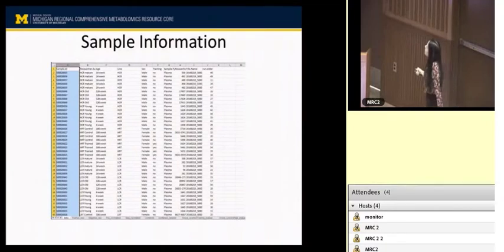And so then with the QC plots, we also give this spreadsheet which has the first tab with the data information that is submitted by the client, and then we assign our sample IDs to each of the samples, and the file name, and match it to the researcher ID submitted by the client. We also give the run order in case people want to do their normalization or anything else, for the samples.